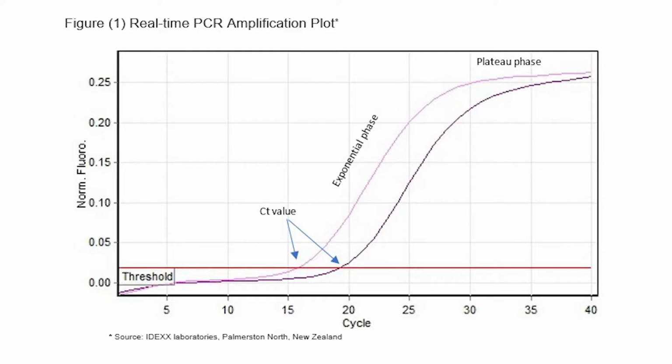The most important thing is to have the right sample type for the test. Please refer to our DOPS for the sample type requirement for each test. After extraction, we go to the second step. The second step is running the real-time PCR reaction. The key feature of real-time PCR is that the amplification of a specific sequence is detected in real time. There is a fluorescence signal which is captured and recorded with each cycle in terms of intensity and wavelength.